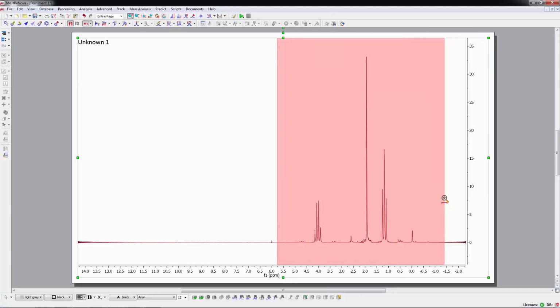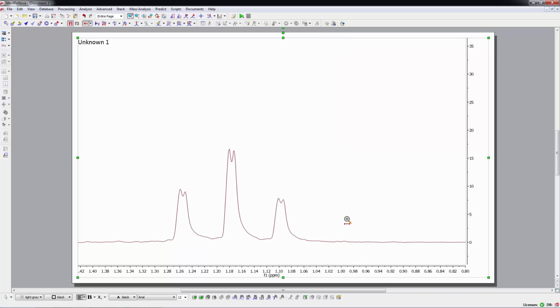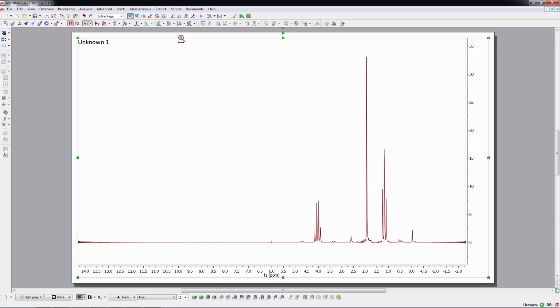This spectrum is okay. That's definitely a quartet, definitely a singlet, definitely a triplet, but it's not perfect. There seem to be some sidebands here and here. Zooming in closely reveals multiple maxima and a non-Lorentzian peak shape. These are artifacts usually caused by a misadjusted shim or occasionally a bad NMR tube. This is still usable data, but some decision-making is required.